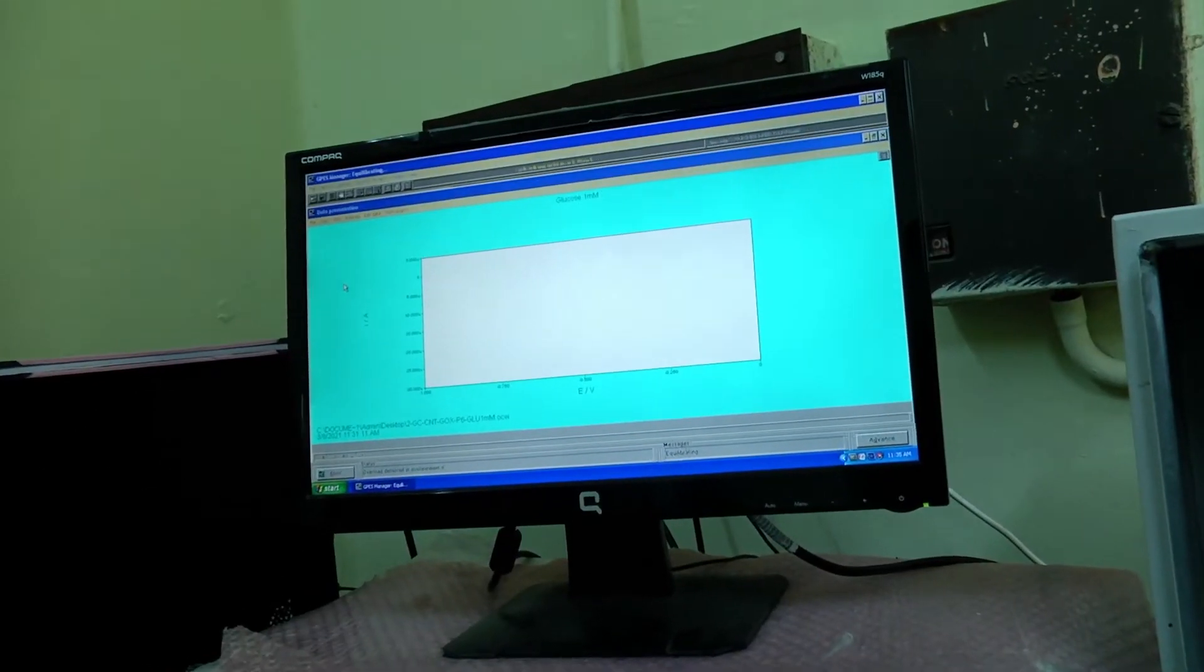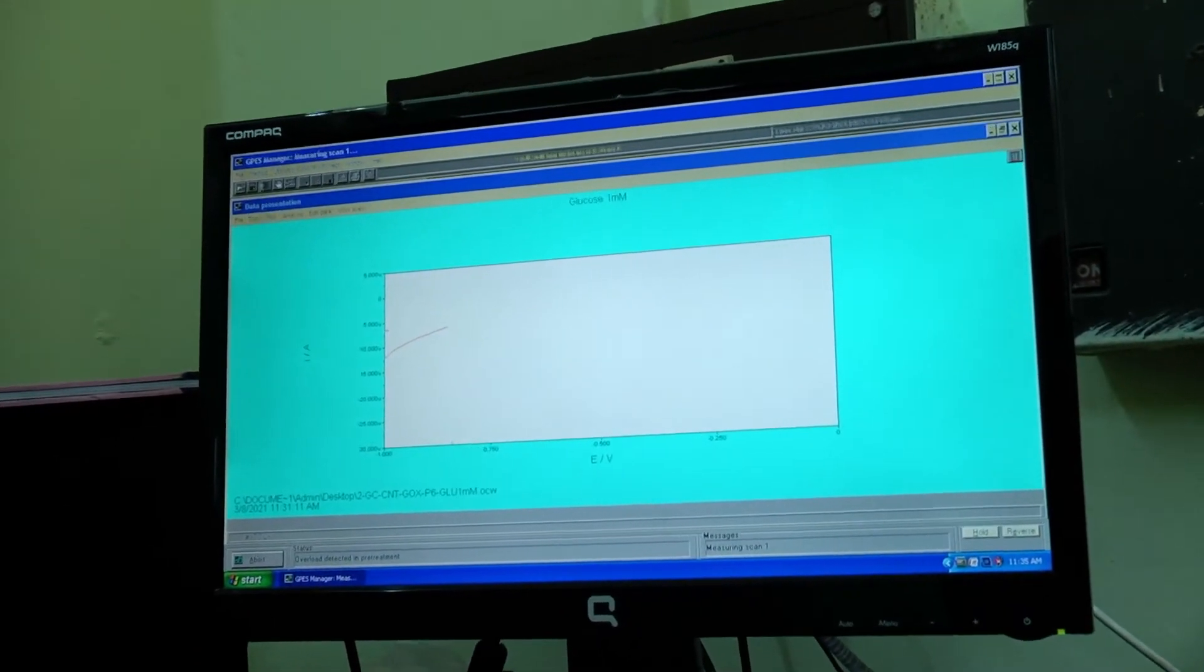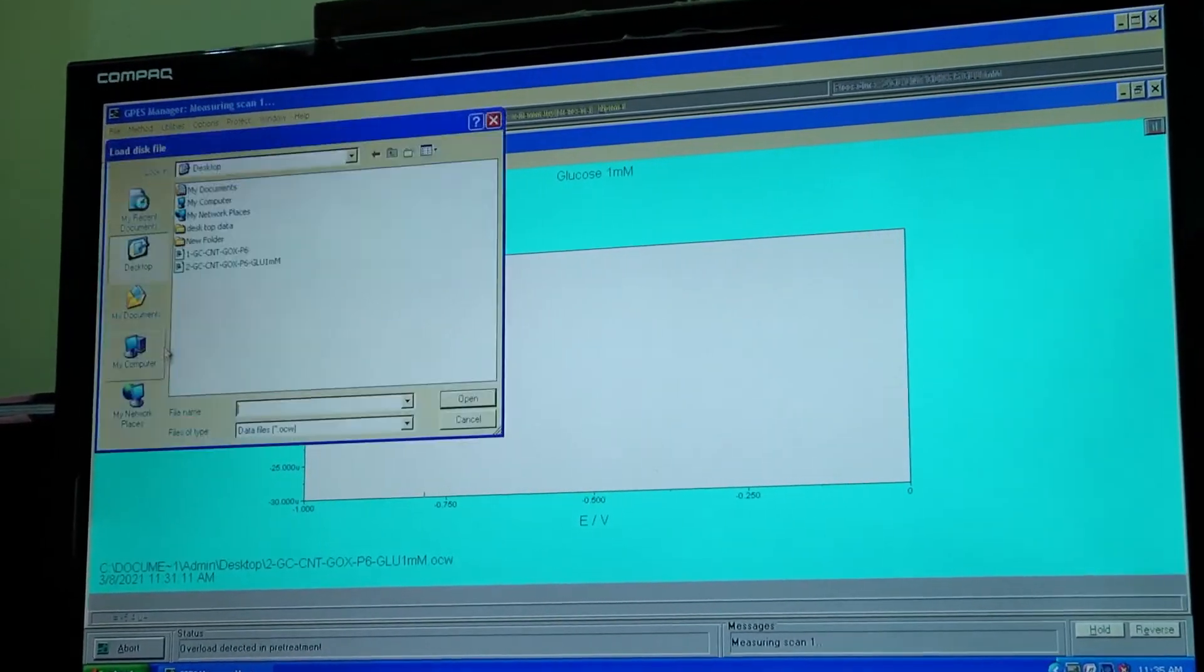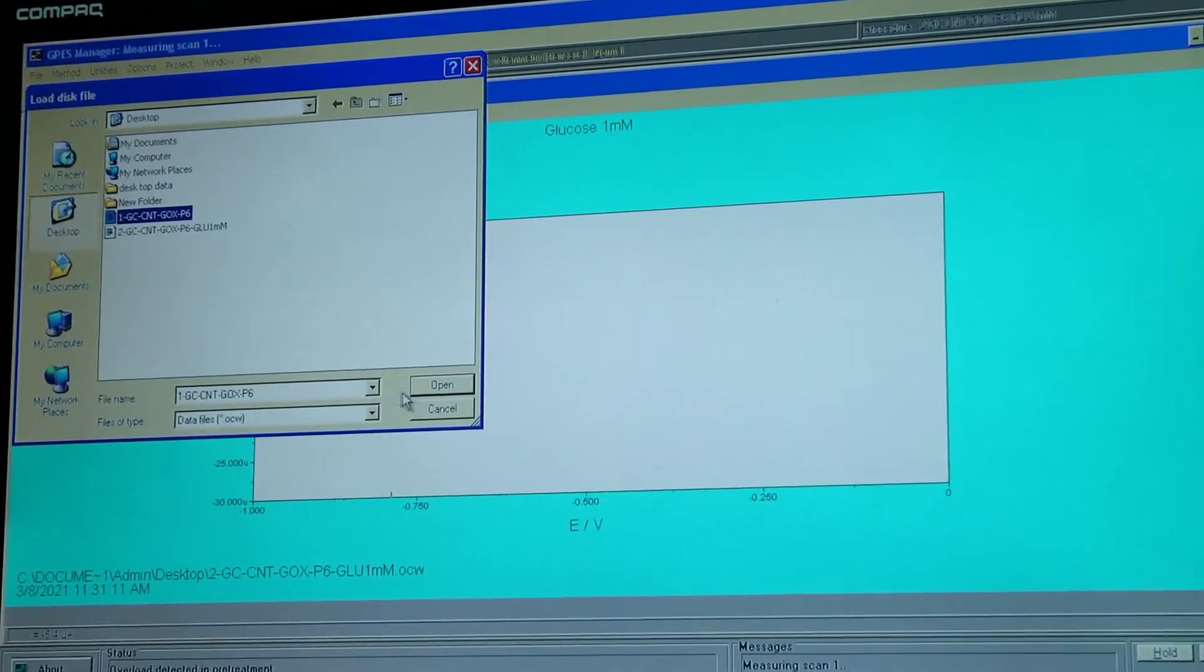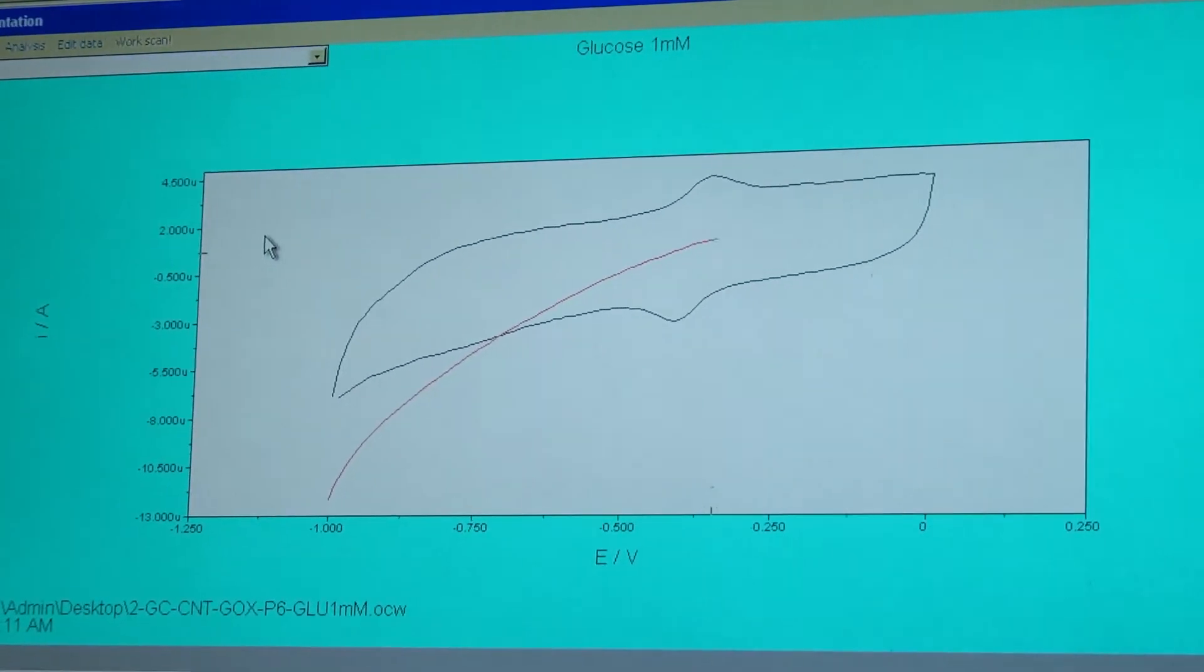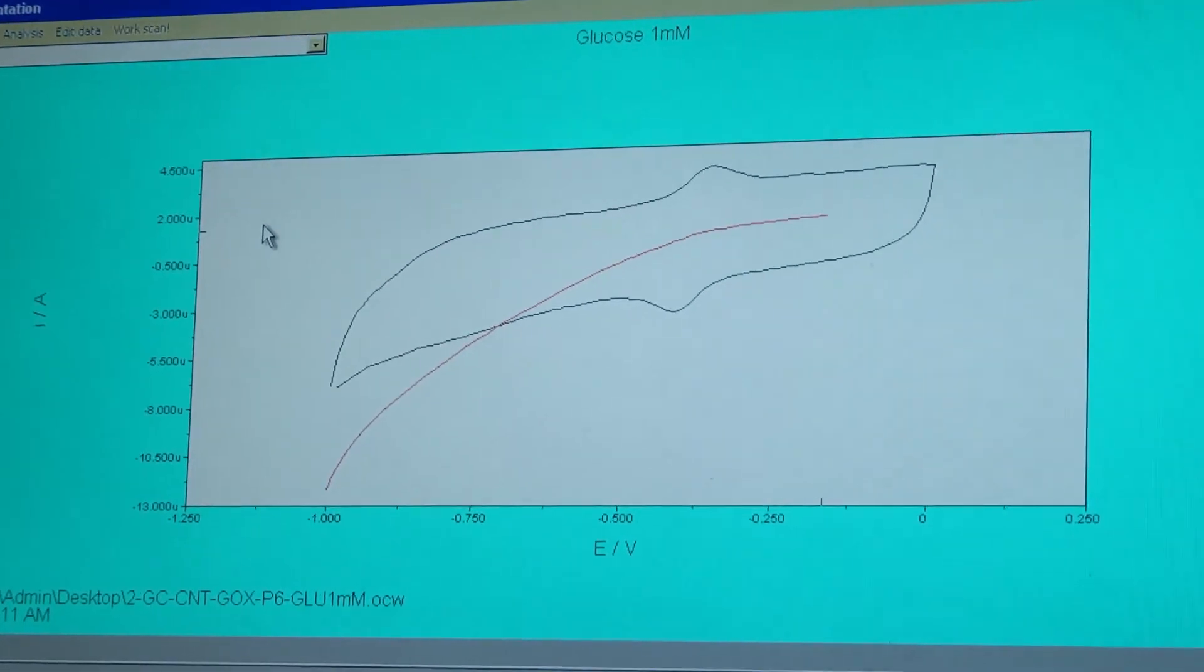Then the corresponding CV is recorded over a potential ranging from minus 1 to 0 volt. As you can see, compared to the CV of enzyme modified electrode before the glucose addition, the current is increased due to the reduction of hydrogen peroxide produced from the enzymatic reaction.